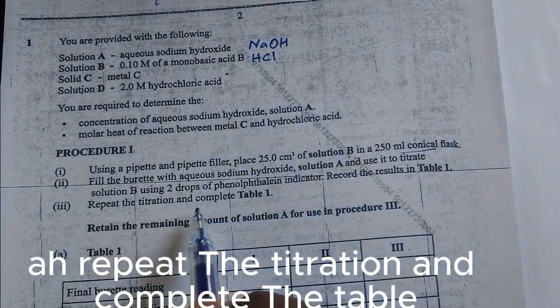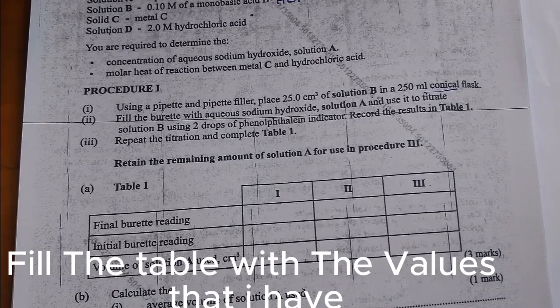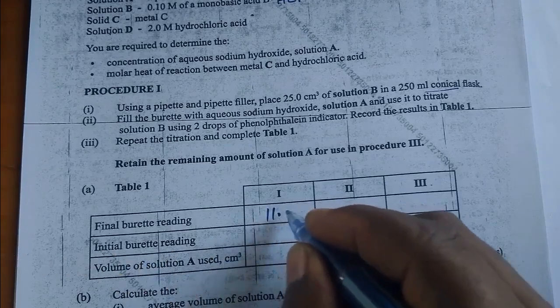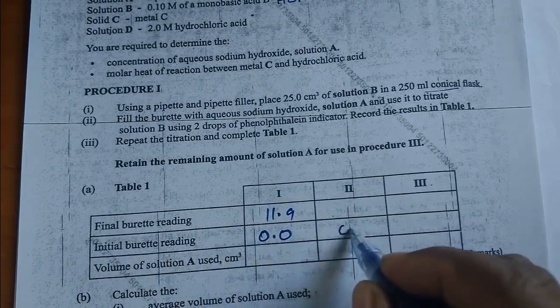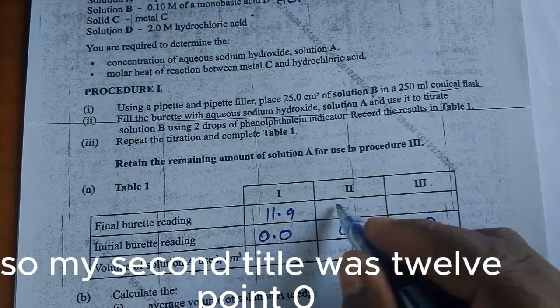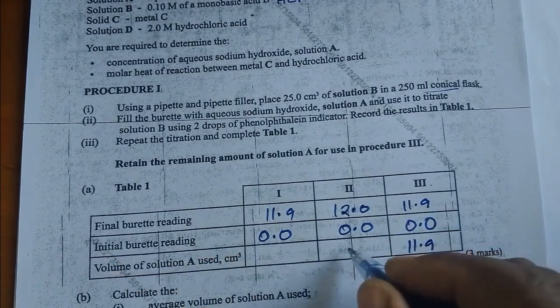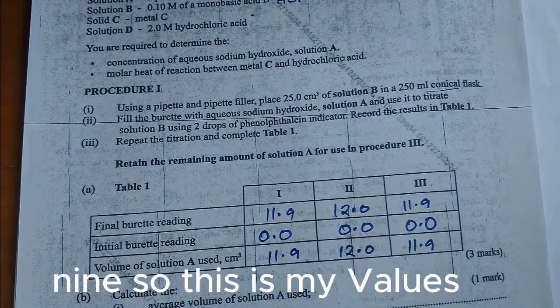We repeat the titration and complete the table. So we are going to fill the table with the values that I have. My first value is 11.9. Initial, it is important you put 0.0 always, so as to avoid mark issues. My second titer was 12.0 and my last one was 11.9. So when you subtract, we will have 11.9, 12.0 and 11.9. So these are my values.